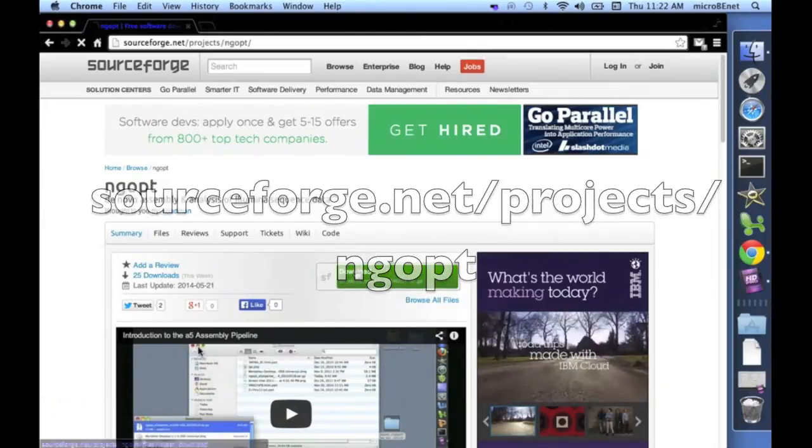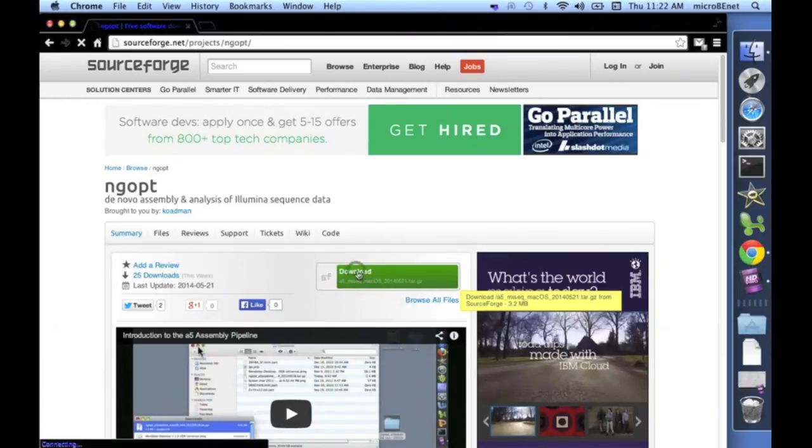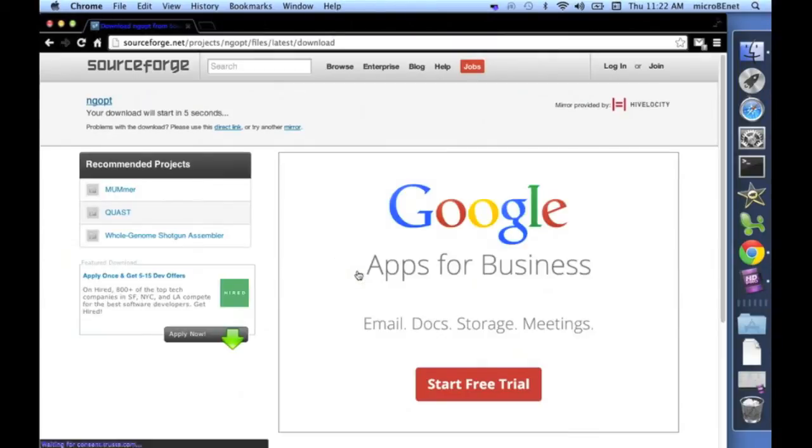SourceForge automatically detects your operating system, so here on a Mac, you can simply download the appropriate version.